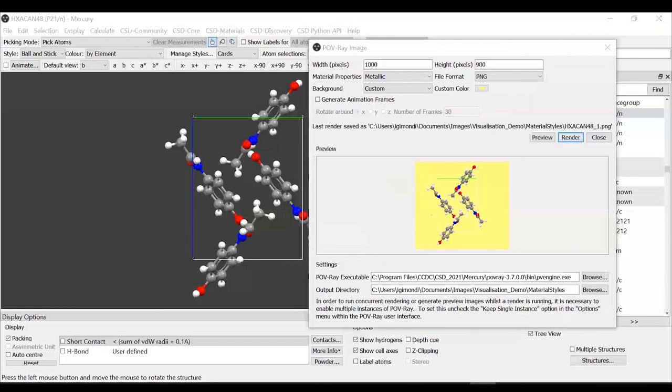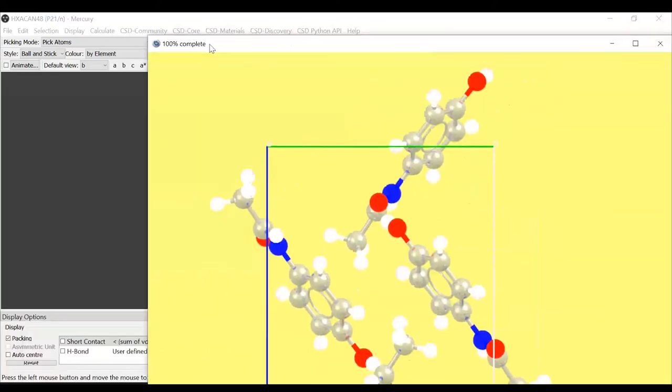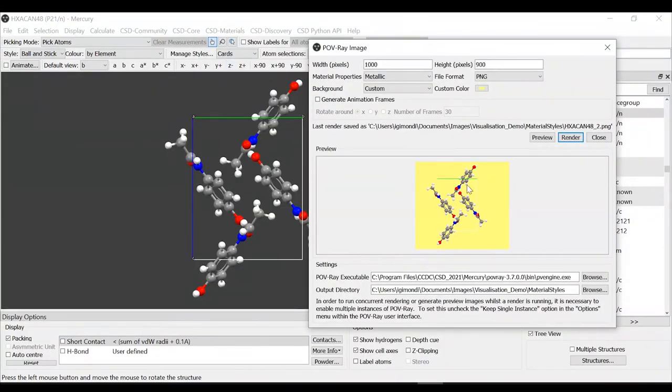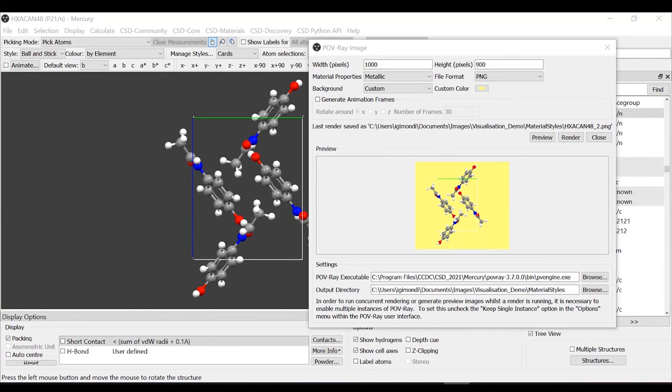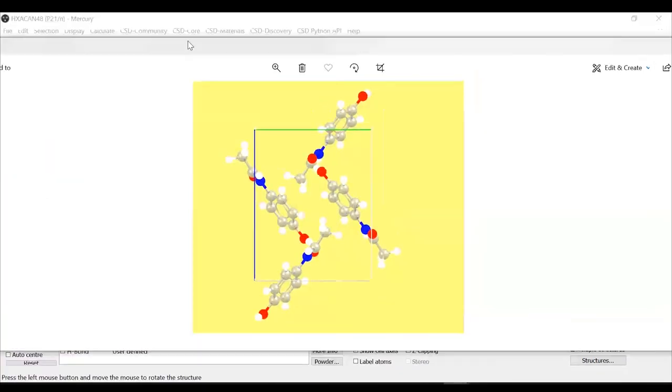Let's render it when we're happy with the representation. We'll do a render and you will see the rendering happening in a separate window. Then you can visualize the structure. I will bring up the image that we've just created together. And so here it is.